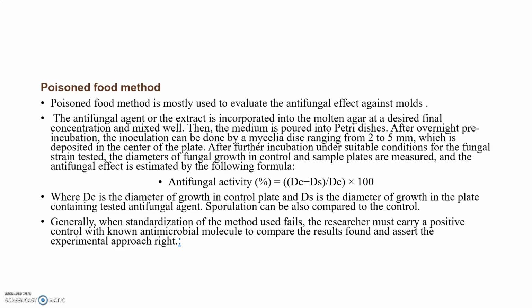After overnight pre-incubation, the inoculation can be done by a mycelial disc ranging from 2 to 5 millimeter, which is deposited on the center of the plate. So the disc is placed at the center of the plate.